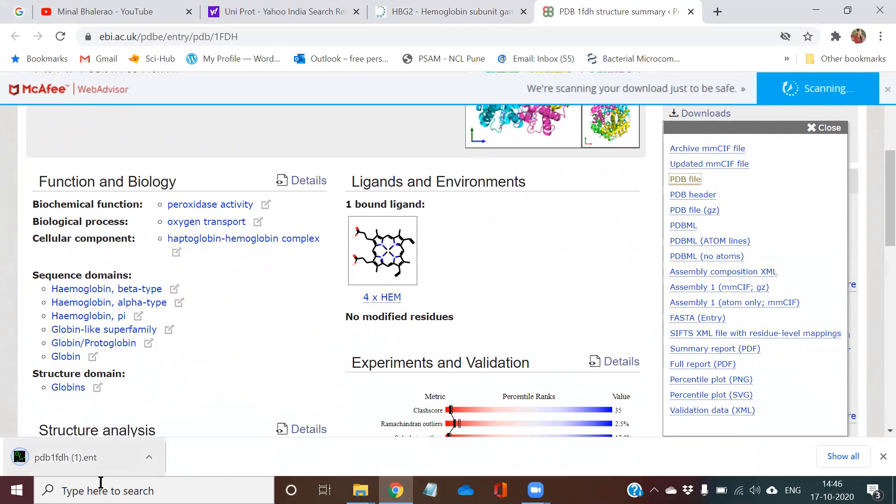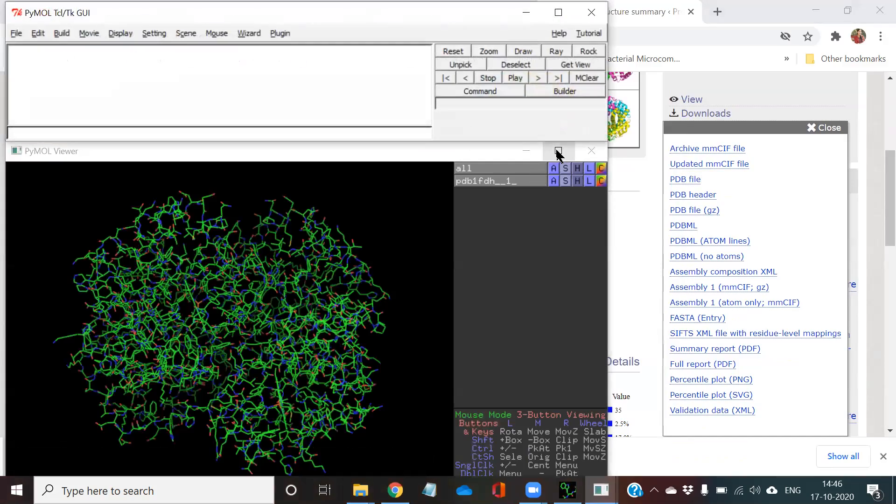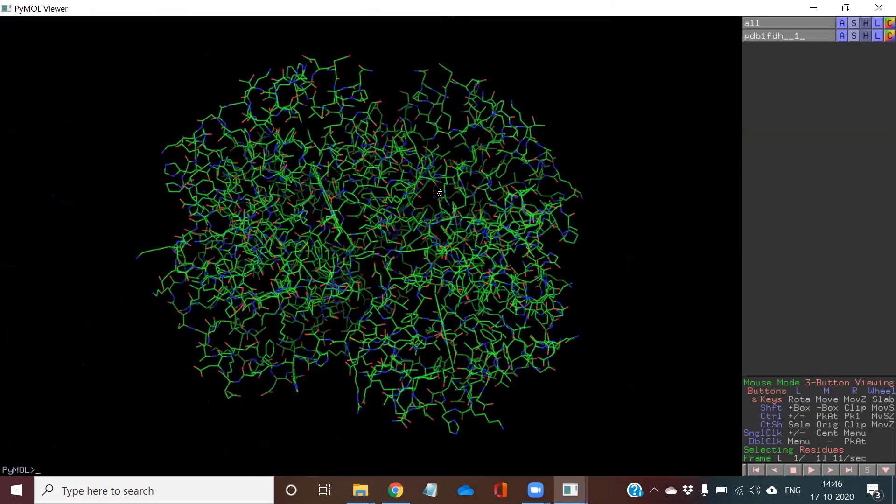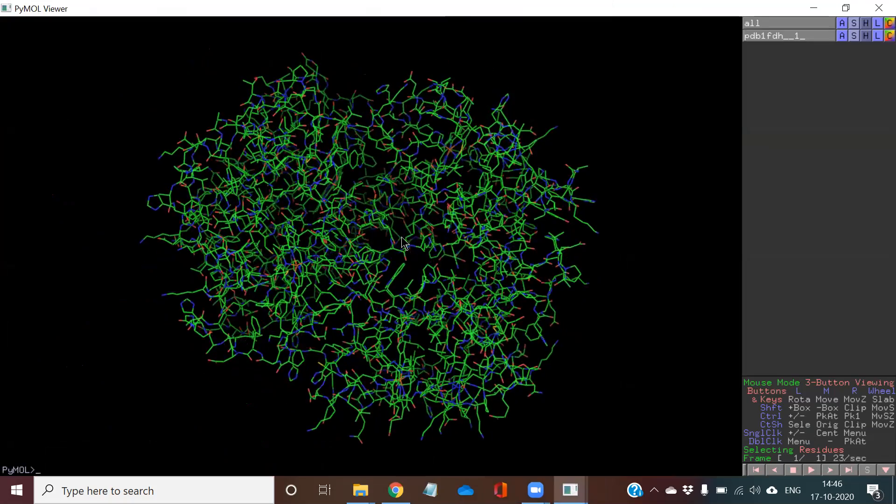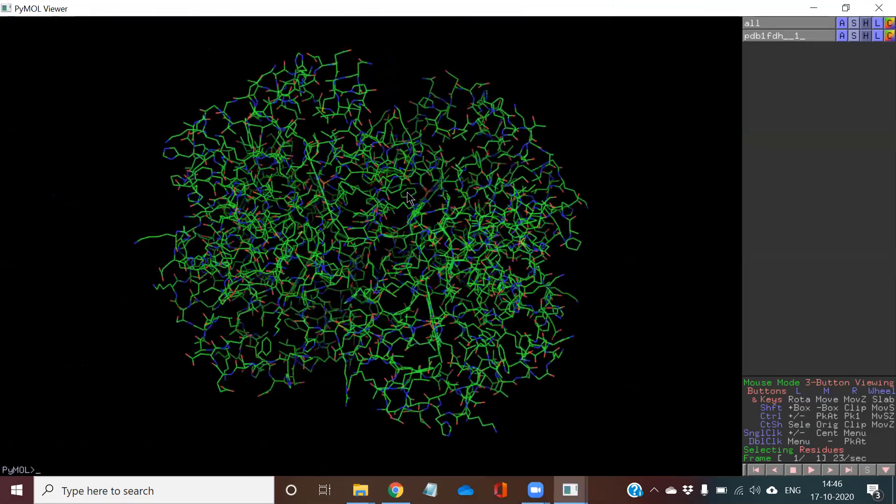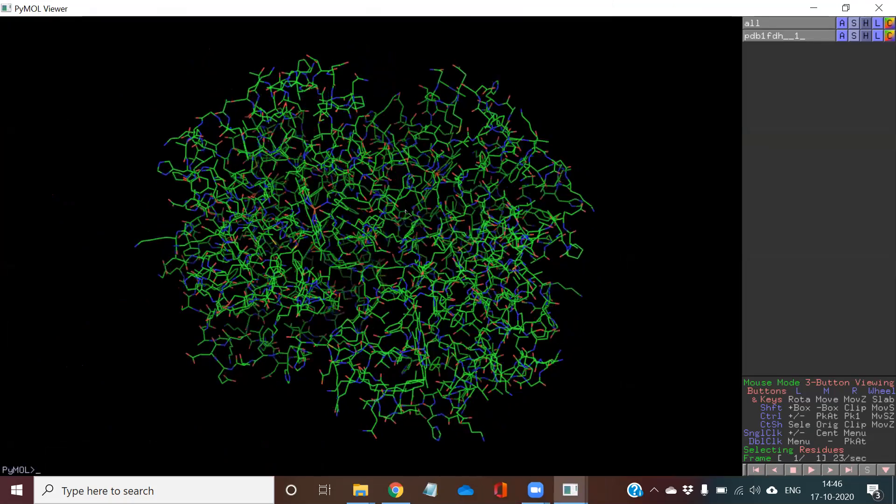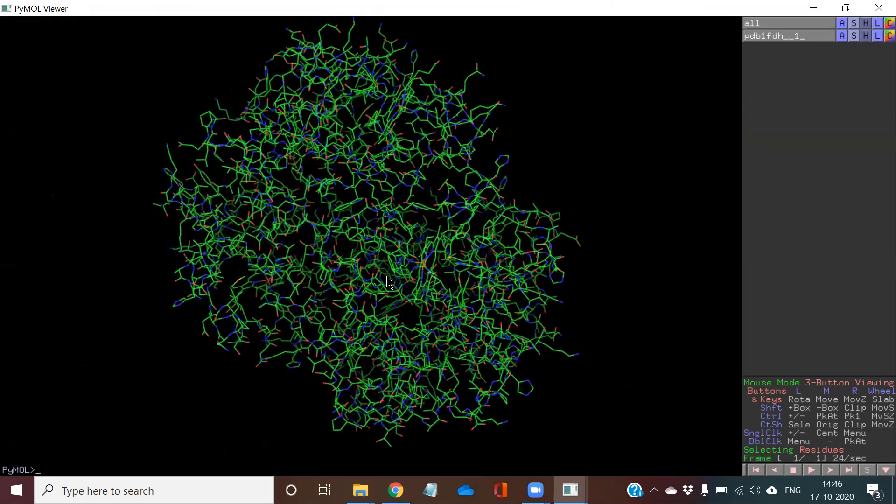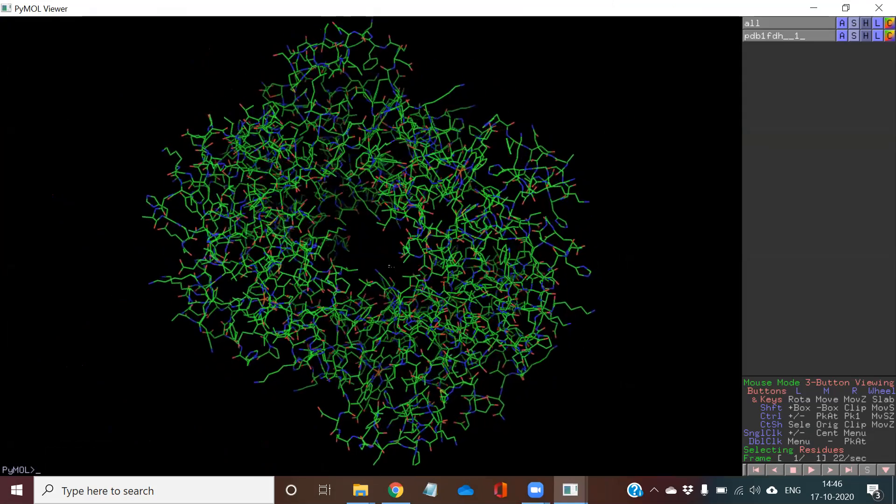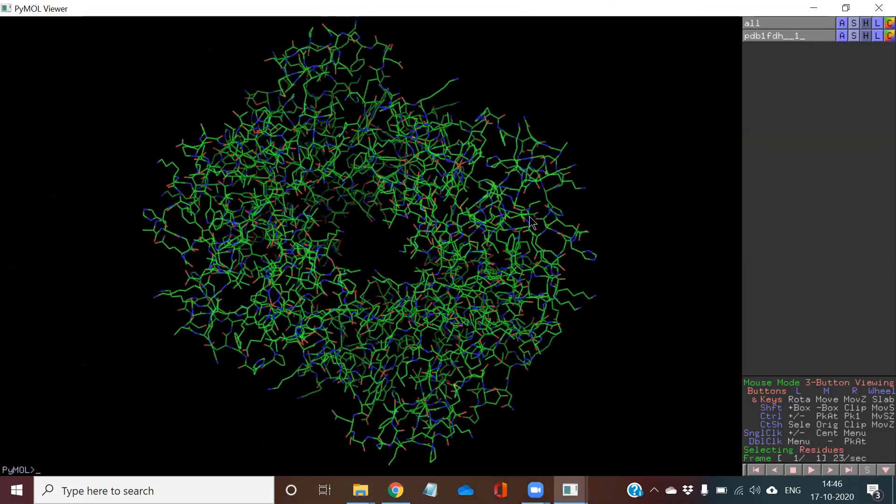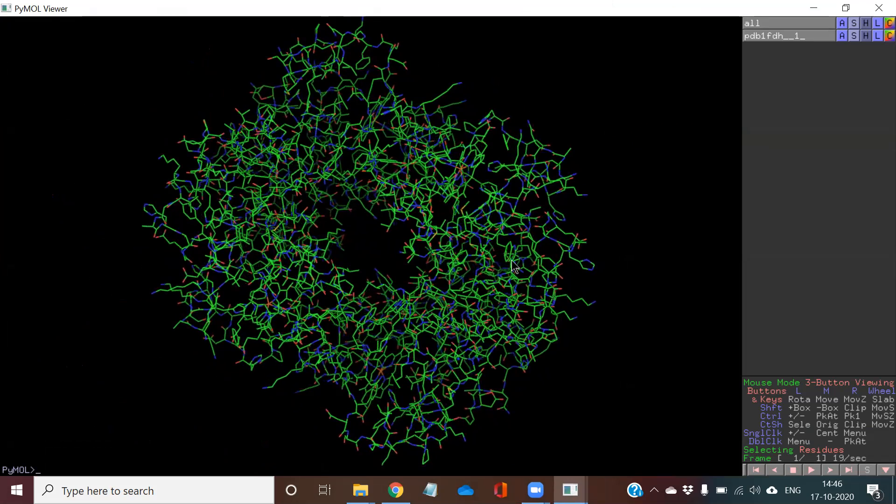Once the protein structure has been downloaded, I will click on it. Now there is a software called as PyMOL. This software has been pre-installed in my laptop. So all of you, those who want to observe the structure of protein, want to play with the structures, want to do some work on the structure of the proteins, you can download this software called as PyMOL or you can install it in your laptop.